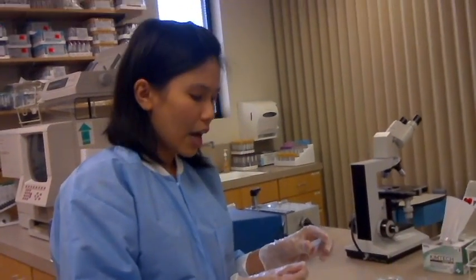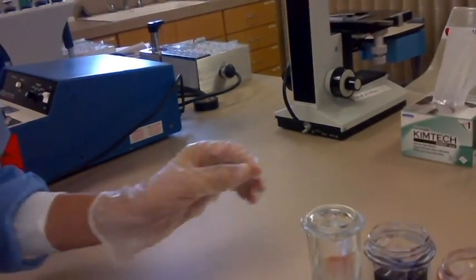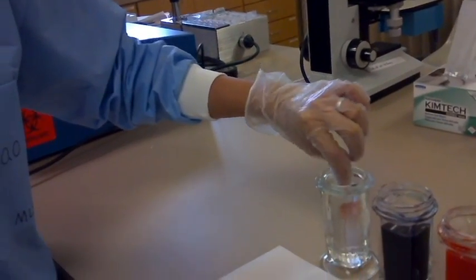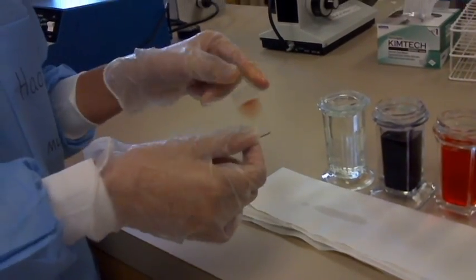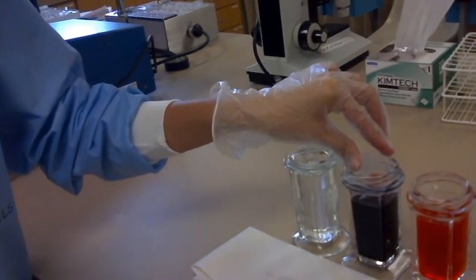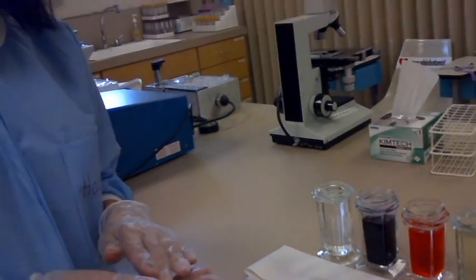First step: I put my smear in methanol for about 1 minute. After 1 minute, I take out my smear, tap on both sides, and then put it in methylene blue for 1 minute. Methylene blue is basic, so it will bind to the acidic structures of the cell, meaning DNA will take up the methylene blue dye.